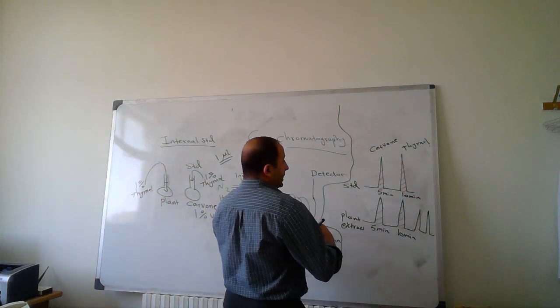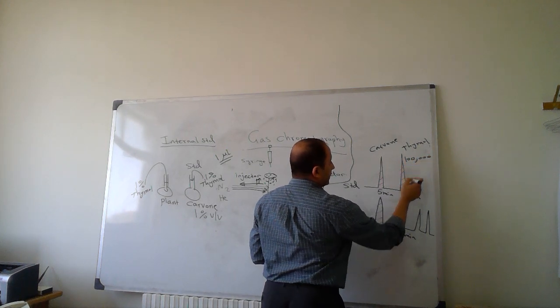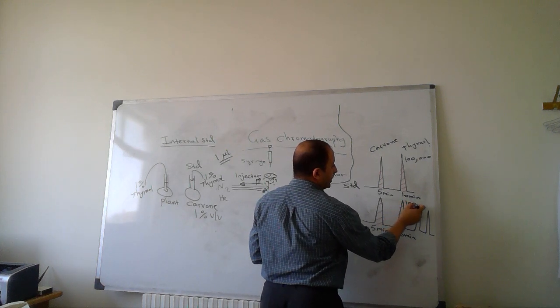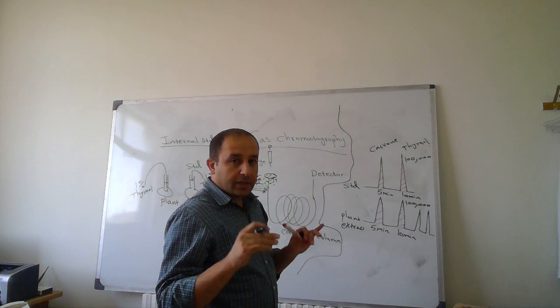Here, if the area under the curve of thymol in the standard is 100,000 and the thymol in the plant extract is 100,000, then there is no difference in the injection volume.